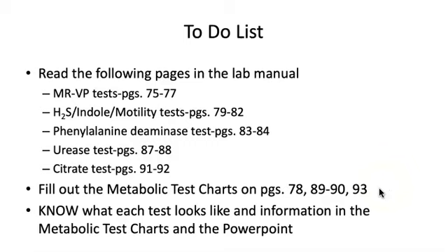I will be putting pictures up of the metabolic charts, but just as we were doing in person, the key information you need to know about the tests is the information that you'll be plugging into the charts, and also what the tests look like. And I'll be showing you pictures of the test results so you can see them and learn to study them. I'm going to be holding you responsible for recognizing pictures of what the tests look like and knowing the information in the charts and the information on this PowerPoint.